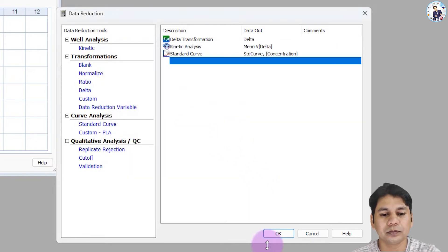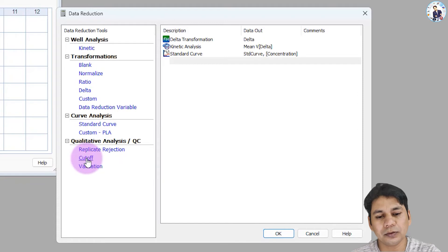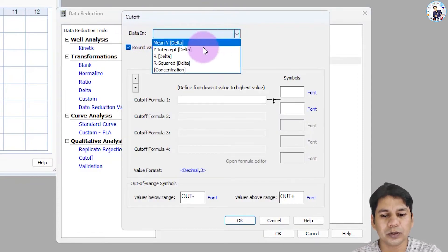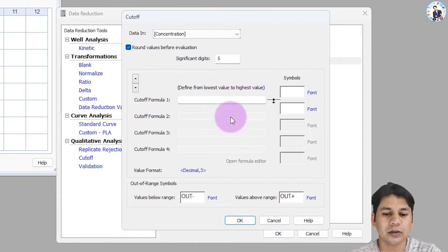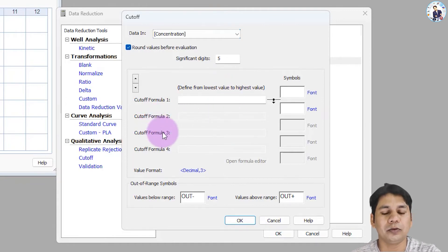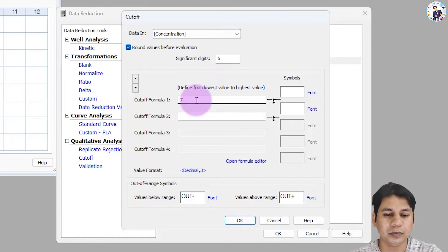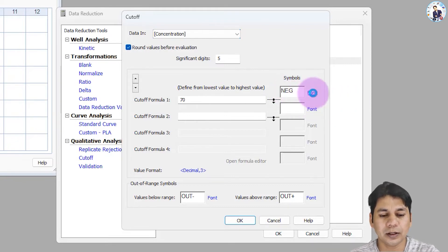After the standard curve step, I am going to set up the cutoff. Click on cutoff. In the cutoff data input, I am selecting concentration. For the cutoff, keep the values in increasing order to make the cutoff formula. For the negative cutoff, the value is 70 pg. Here you can assign the label 'negative' and assign a color.